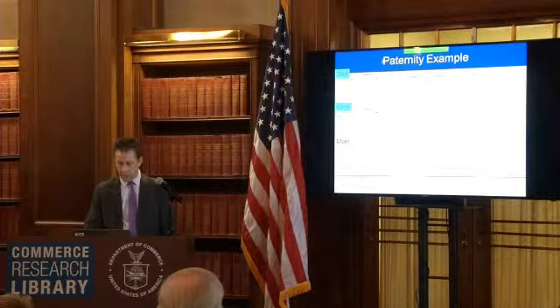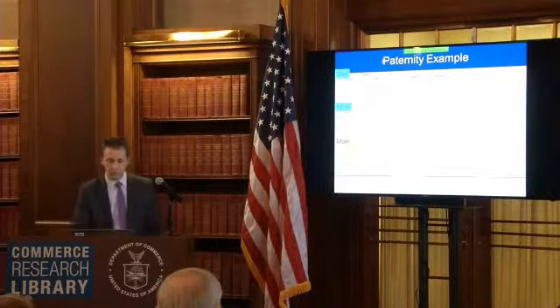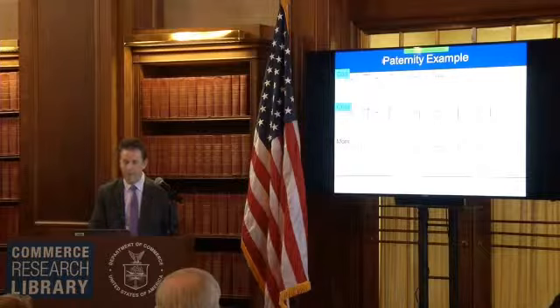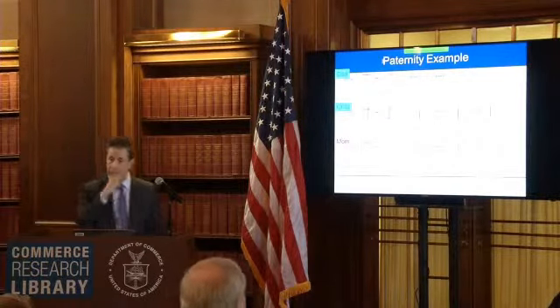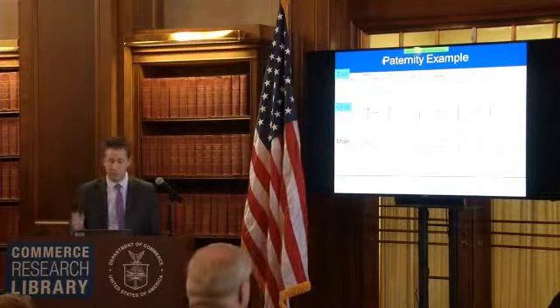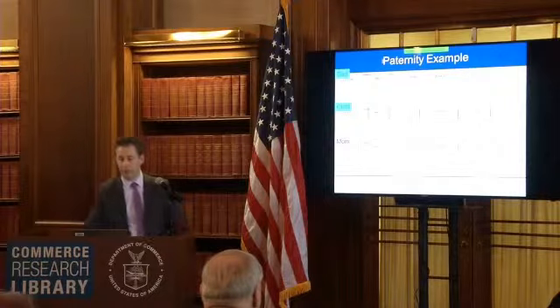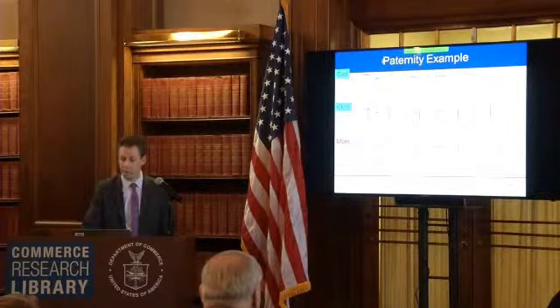So if you have the child, what this illustrates is that you get one from your mother, one from your father. So the idea is you can match up which allele or which allelic state you got from your mother, and which one you got from your father. In the first case here, it's easy to see that the child's a 14, 18, so that means he had to get the 18 from his father and the 14 from his mother.